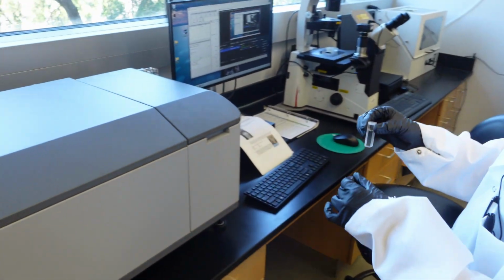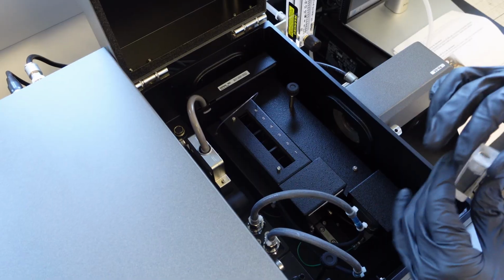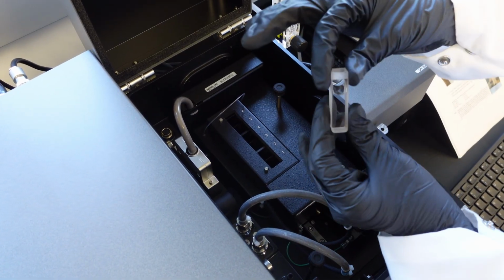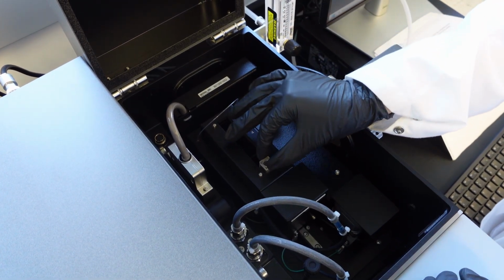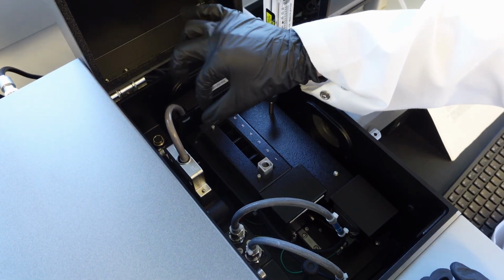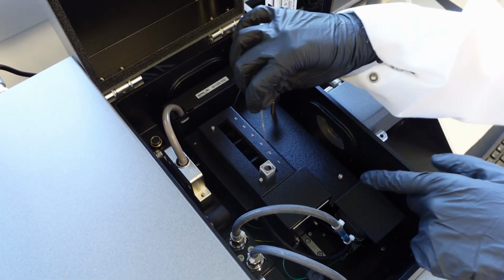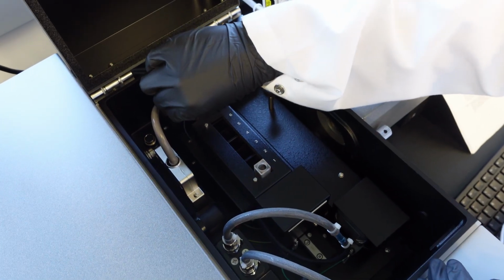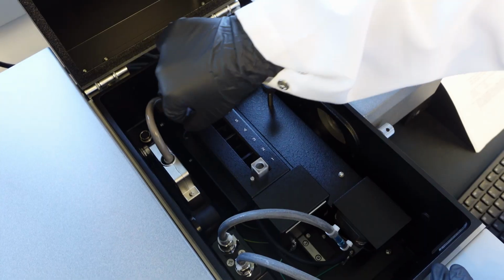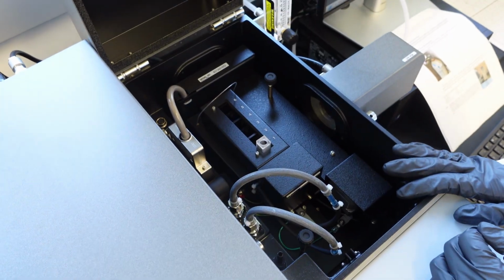And then to load the sample inside, we'll lift this up. There's 6 different spaces that you can put the sample into. The detector is here, so you just want to make sure that the clear sides are in this direction. So we're going to put it into number 1. And then this wire also can measure the temperature. So if you want to have the temperature recorded of your sample, you can stick it inside. But if you're not using it, just make sure it's not free floating and you tuck it back into here. And then that way it's just reading the temperature of this whole setup.